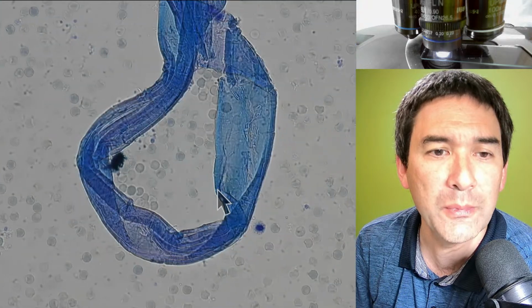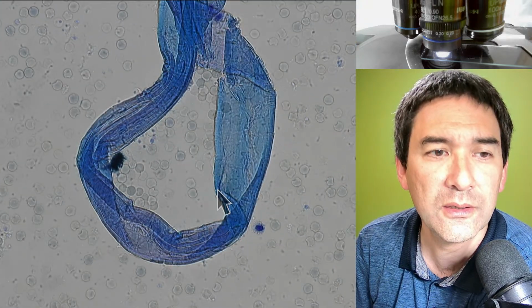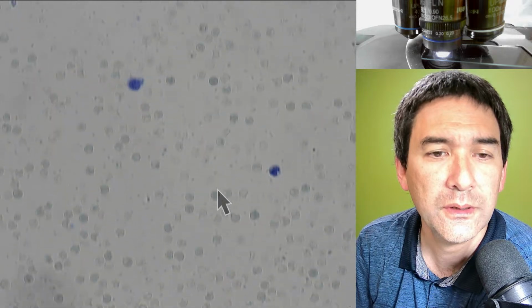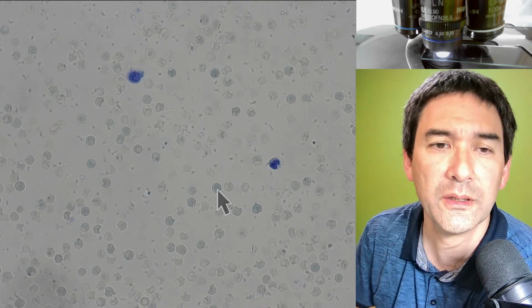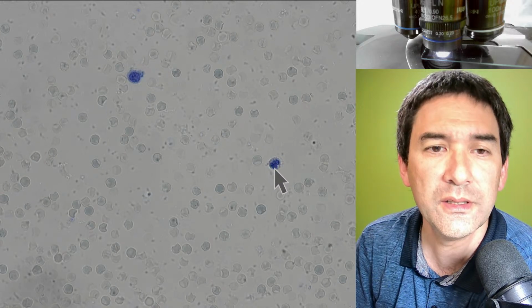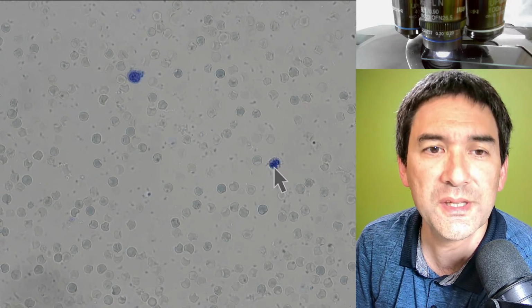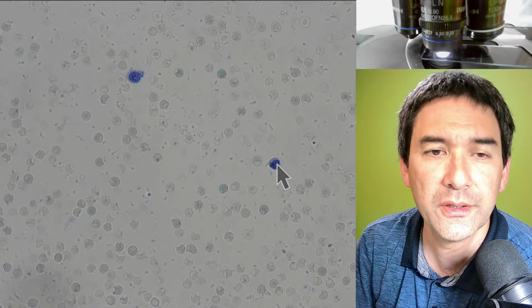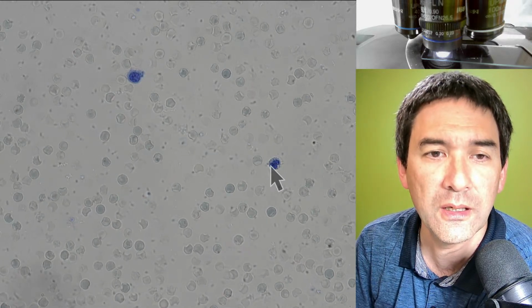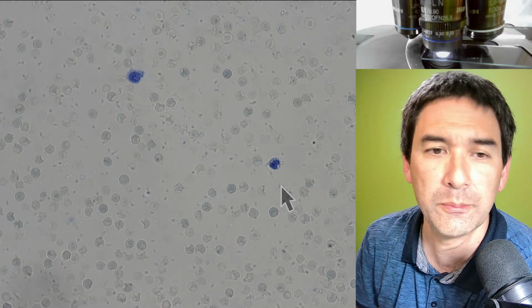Again, it's a contamination here. We just ignore that. Here might be one a little bit. You can actually see that this nucleus over here, in the center, is not completely round, but seems to have lobes. And depending on whether it has a round nucleus or a lobed nucleus, you can basically distinguish different white blood cells.